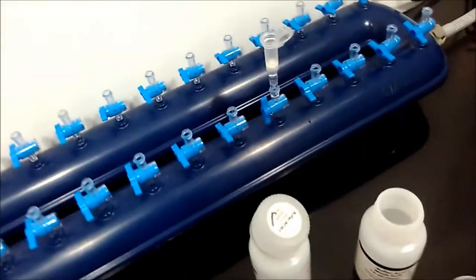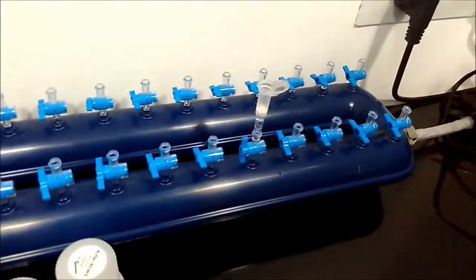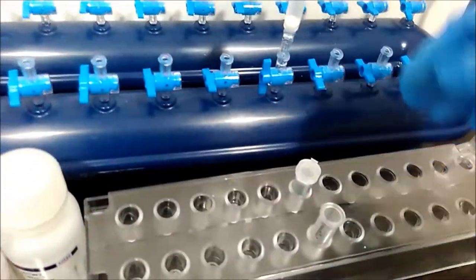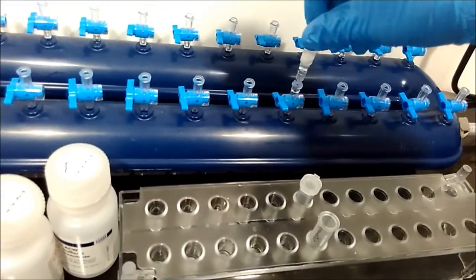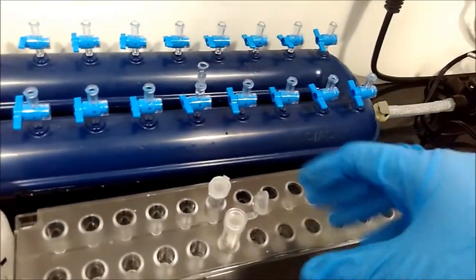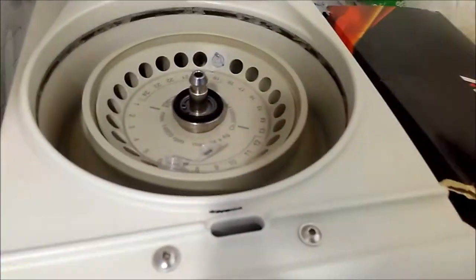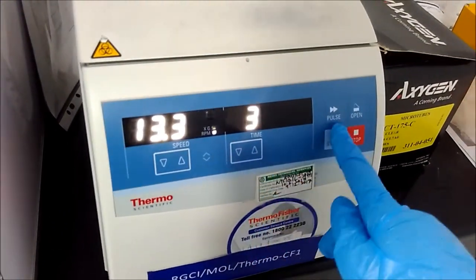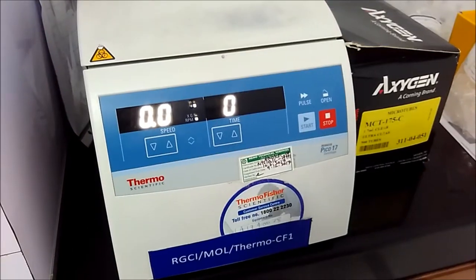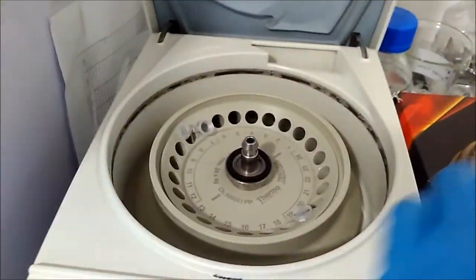Now we are going to give a dry spin to our column. Dry spin is basically spinning the column at very high speed for two to three minutes. I transfer it to another collection tube. The lid is kept open so that all the isopropanol and ethanol evaporates properly, ensuring there is no PCR inhibition. The dry spin runs for three minutes.